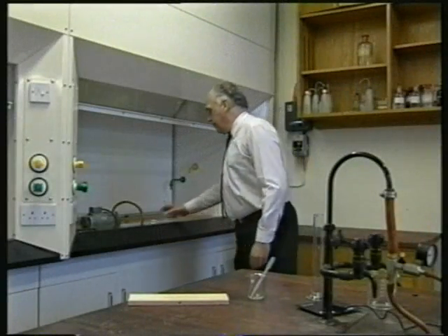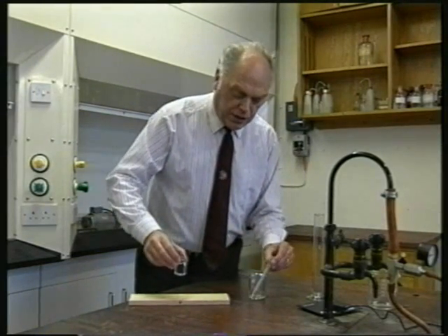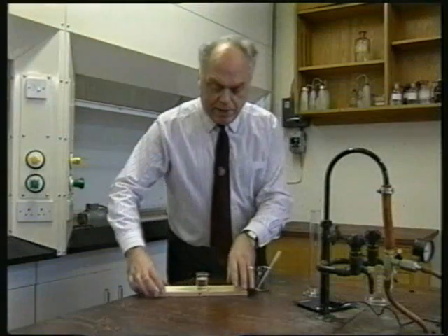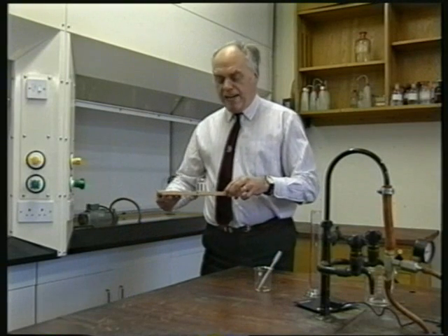Right, I've got some petrol in this beaker. I'm going to put a few drops of water underneath it, and then put this in the fume cupboard so that I can blow air through it.